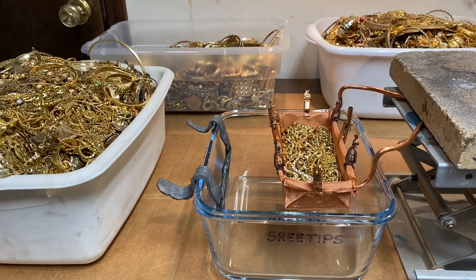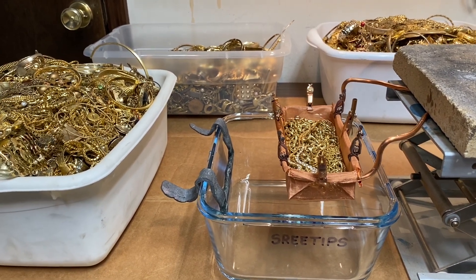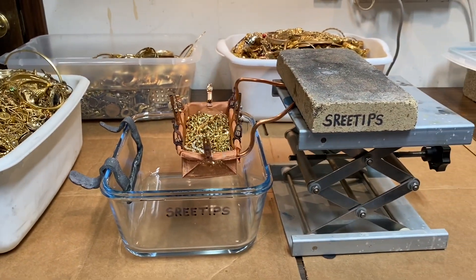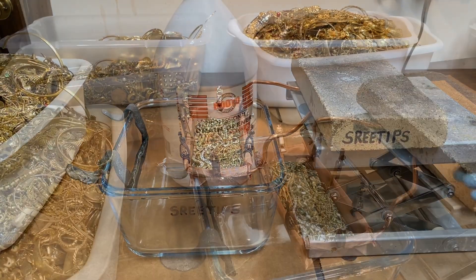Before we do that, we'll weigh it up to make sure we can calculate what our yield is going to be. And then we'll put it in that basket and lower it down into the cell, like so.